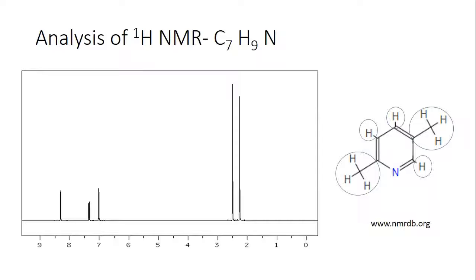To do this, you pick one hydrogen from each environment and look at the carbon it's bonded to. Then you're going to look at one carbon over and count how many hydrogens are there, not counting the ones that are in the same environment as the one you started with. That number is your N. So then you add 1 to that N value, and this number should correspond to each splitting peak in the graph. So for example, let's take this environment right here.